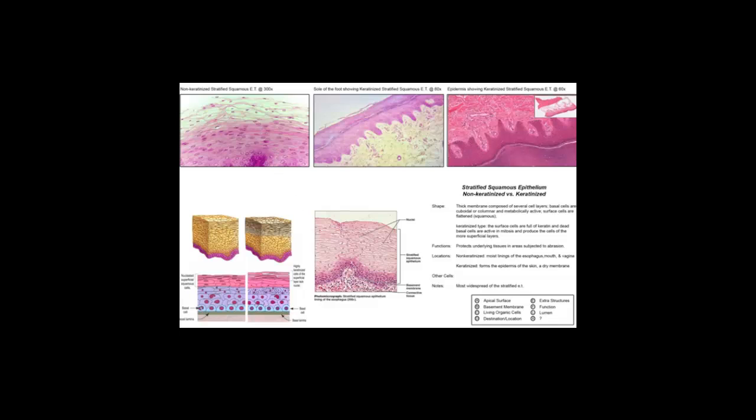These cells are also all non-keratinized stratified squamous epithelial cells. They are all living, and they're what we obtained cheek cells from that we stained in Lab 2, and we stained with methylene blue and viewed in the microscope for the first time in this class.